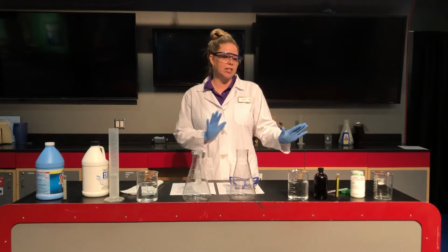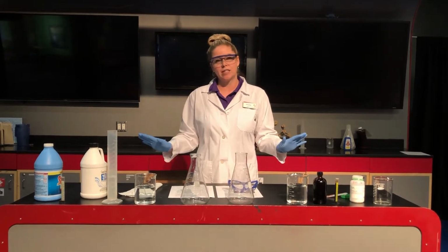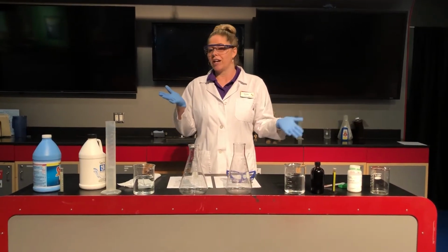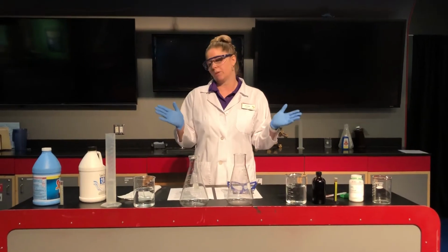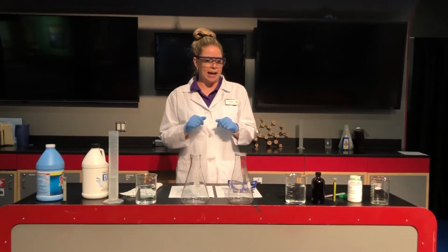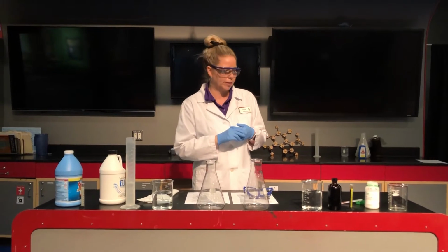If you were doing some kitchen chemistry, you might also use your sense of taste, but today we're just gonna use those other senses, and we're gonna make observations to see when a chemical reaction has occurred, if a change has taken place. So that's what we're looking for, to see if when we combine ingredients, we can create something else. That's really what chemistry is all about. So we'll make some predictions along the way and see if we can create a different colored solution from the one we started with. So that's gonna be our goal today.